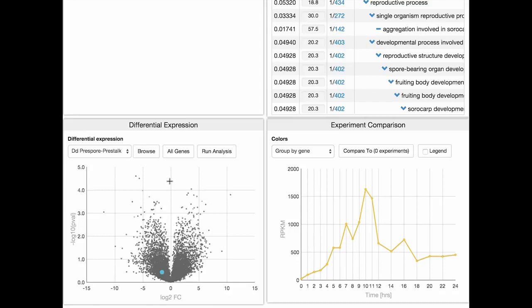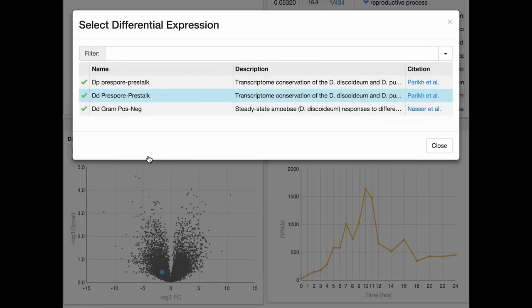Genes at the top are more significantly differentially expressed than genes at the bottom. The Volcano plot in this example shows the data from Parikh et al. paper from 2010.